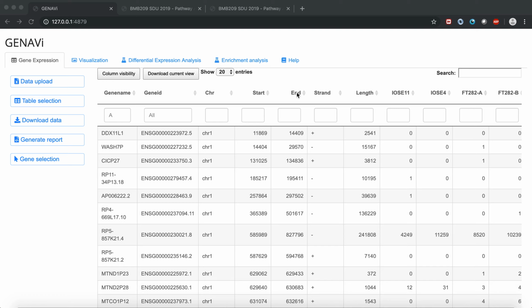Hello, in this video we are going to cover the enrichment analysis within GENAVi. I'm running a local version of the app, and this enrichment analysis simply comes after the differential expression analysis.